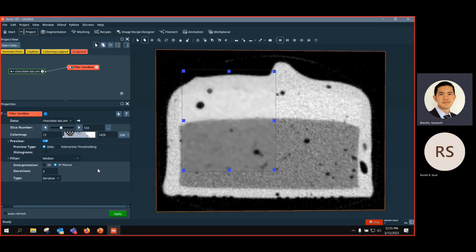And later, if you're interested, we also have deep learning. You can also use the deep learning denoising model that we have to try on your data. It's actually designed for EM data, so I'm not sure it's going to work with CT. If you work on EM and you need a denoising deep learning model, just let us know.